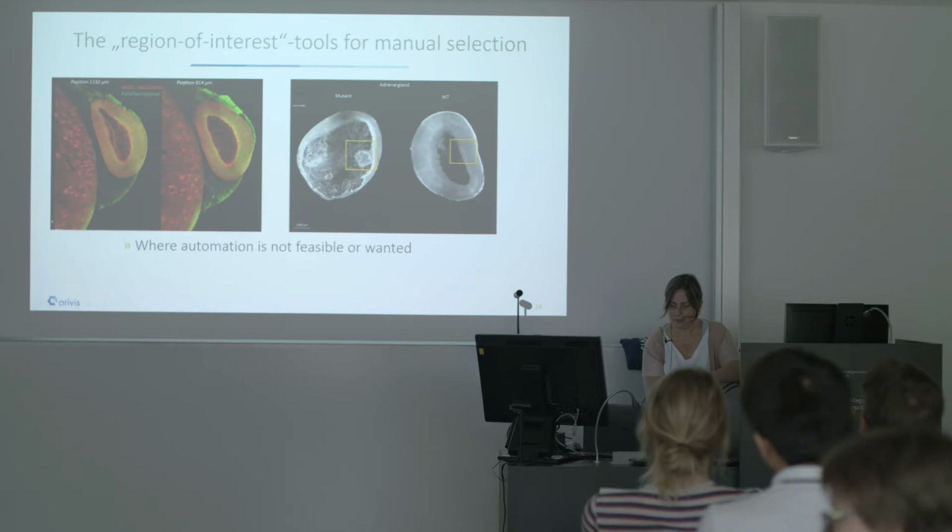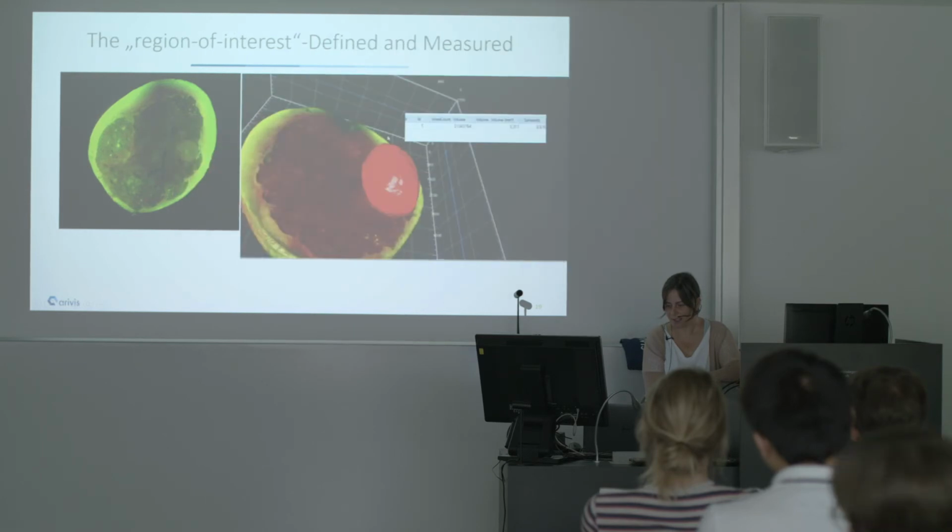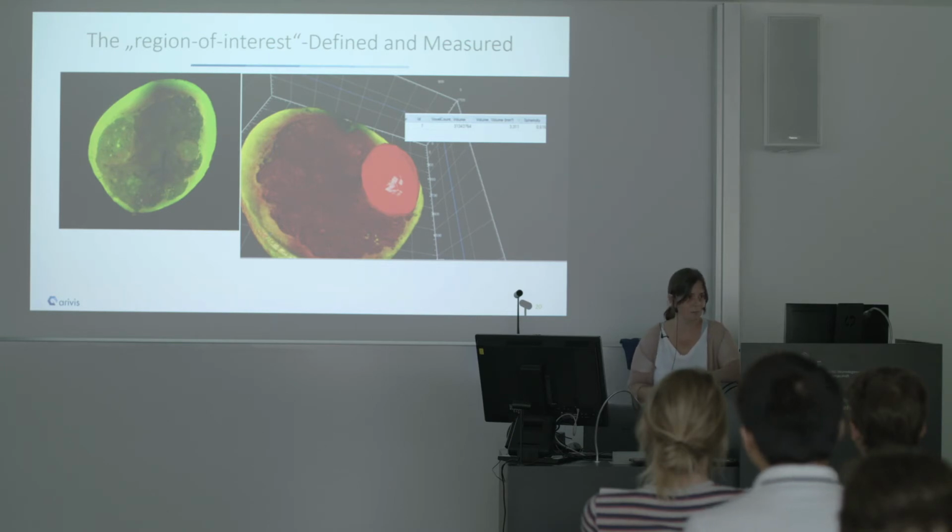And so there are tools, of course, in Vision 4D to allow you to do this. And here are some screenshots depicted from a workflow David and I did recently. And it is nice because at the end you can create numbers out of this. Sometimes there is simply no other way than doing things manually, and you have very interactive tools here with preview to do so.